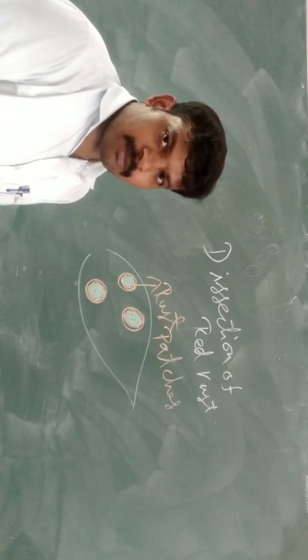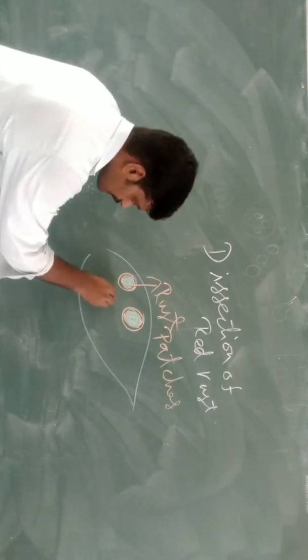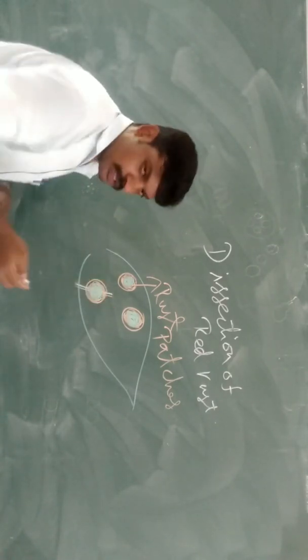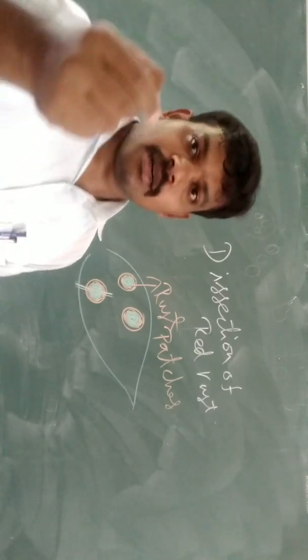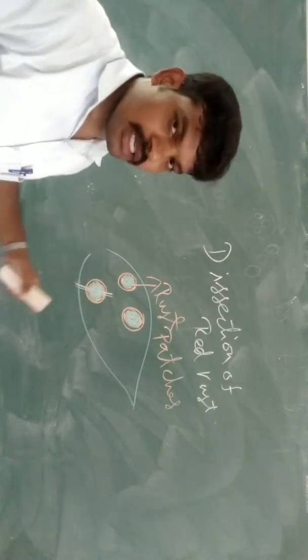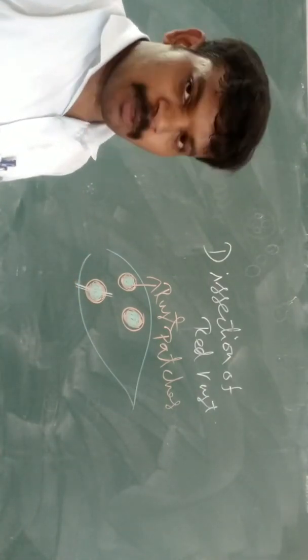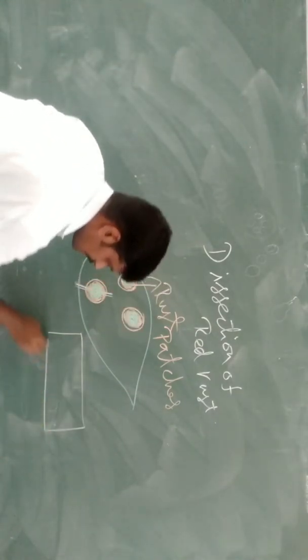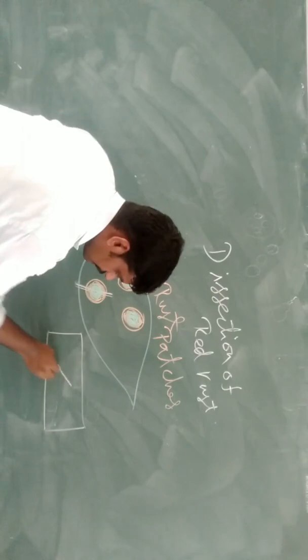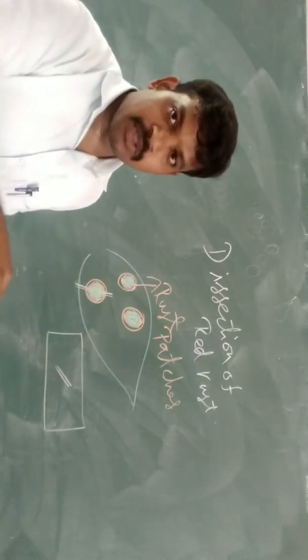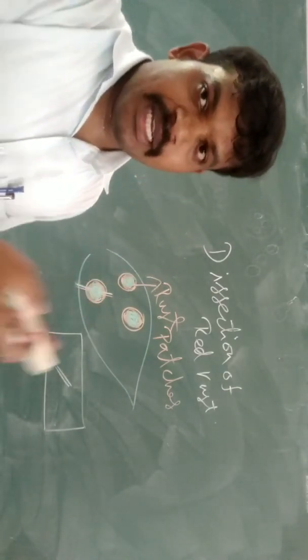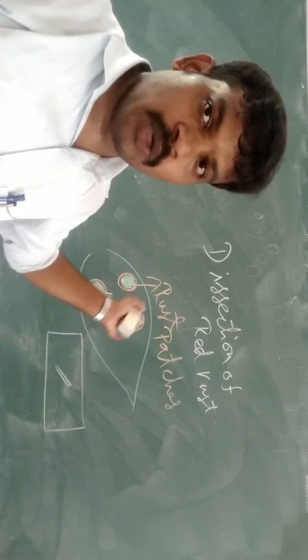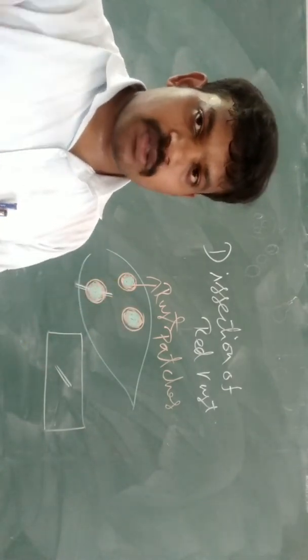Next is dissection. If you look at this, infection is very minute, hair-like pieces. Then the diseased portion should be placed on glass slide. The slide is in the microscope. This is in the bottom of the center. Then when the piece is in the microscope, we can see the structure. We know what the shape of the spore is.